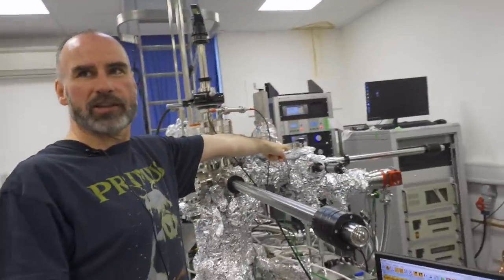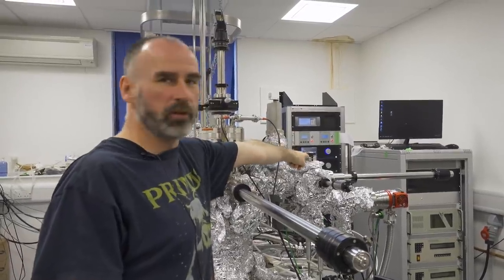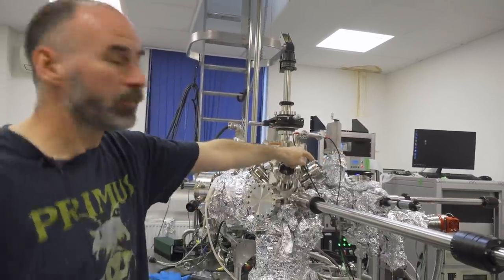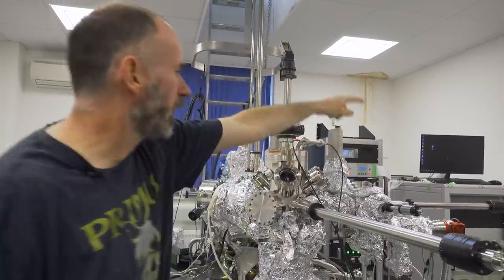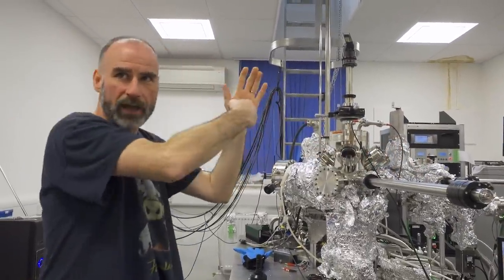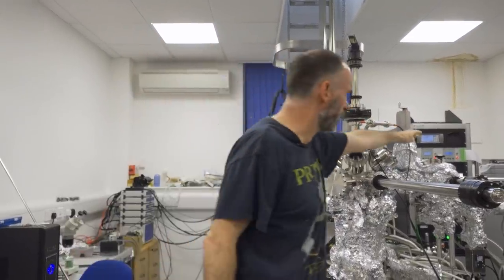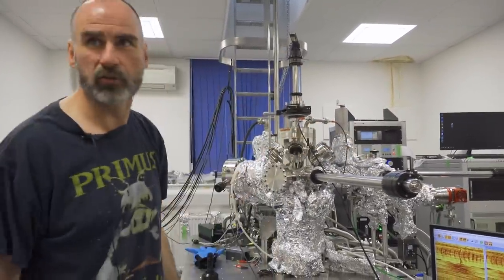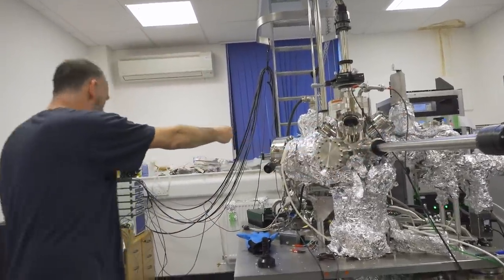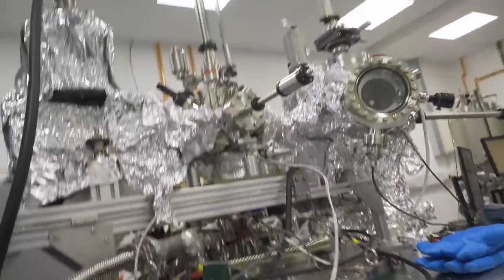This is where the samples are introduced. This is called a load lock. We'd open this up, we'd unscrew this, we'd put our sample in on the end of this arm, then we'd pump this down, then we'd open that valve, then we'd move our sample into this chamber, and then we'd bring this one in to couple with that, pick it up, take this arm back, shut this off, so now it's isolated from this load lock, and we can then wait for the pressure to recover. And then we can take our sample and bring it all the way in here to this monstrous beast of a transfer arm, all the way up there.